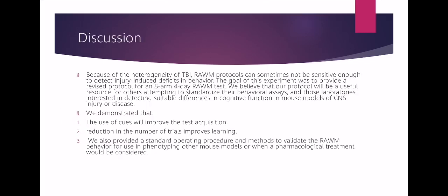Because of the heterogeneity of traumatic brain injury, RAWM protocols can sometimes not be sensitive enough to detect injury-induced deficits in behavior. The goal of the experiment was to provide a revised protocol for an 8-arm 4-day RAWM test. We believe that our protocol will be a useful resource for others attempting to standardize their behavioral assays and those laboratories interested in detecting suitable differences in cognitive function in mouse models for CNS injury or disease.